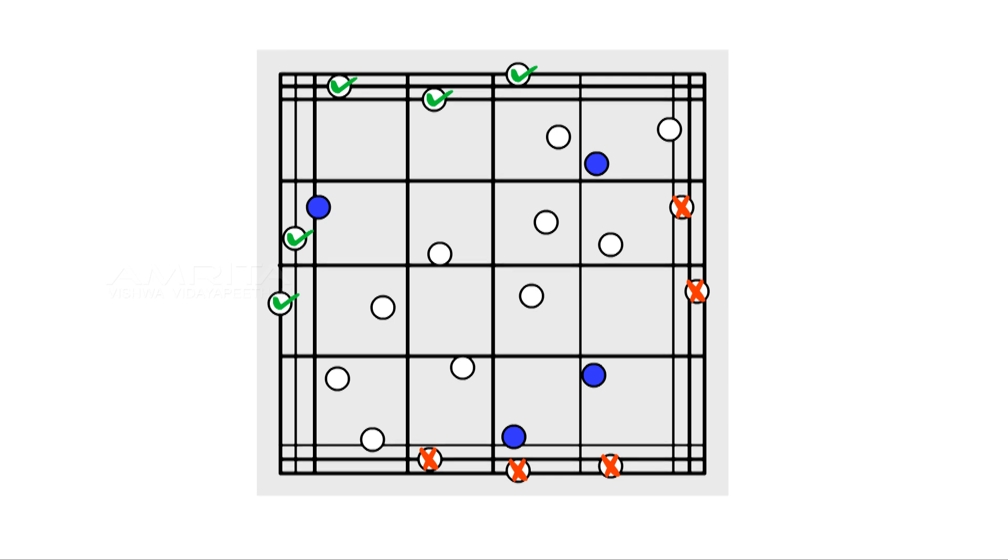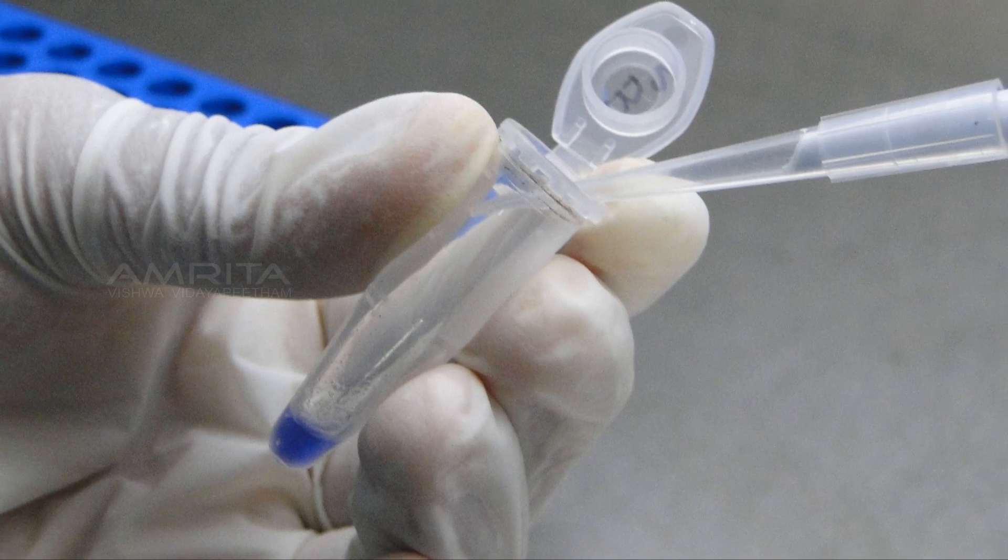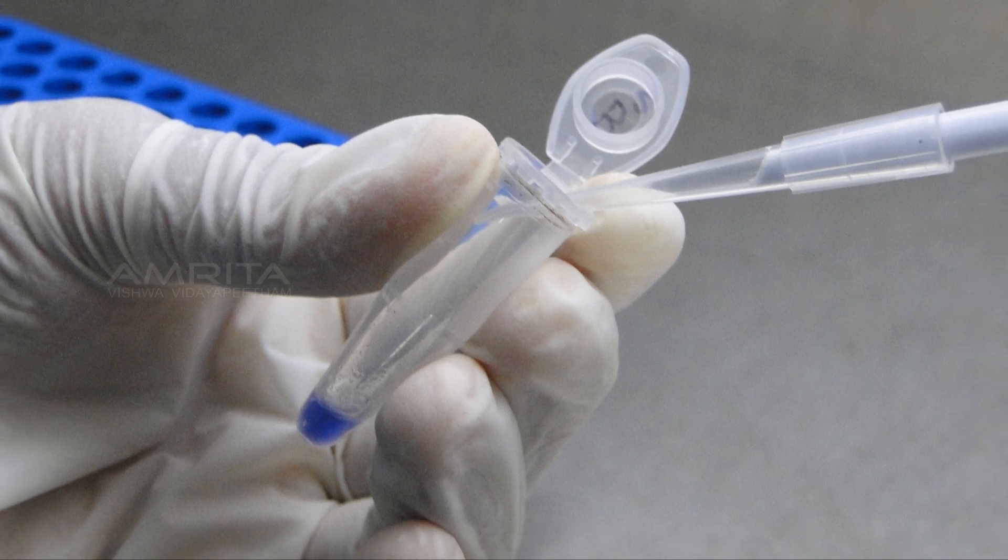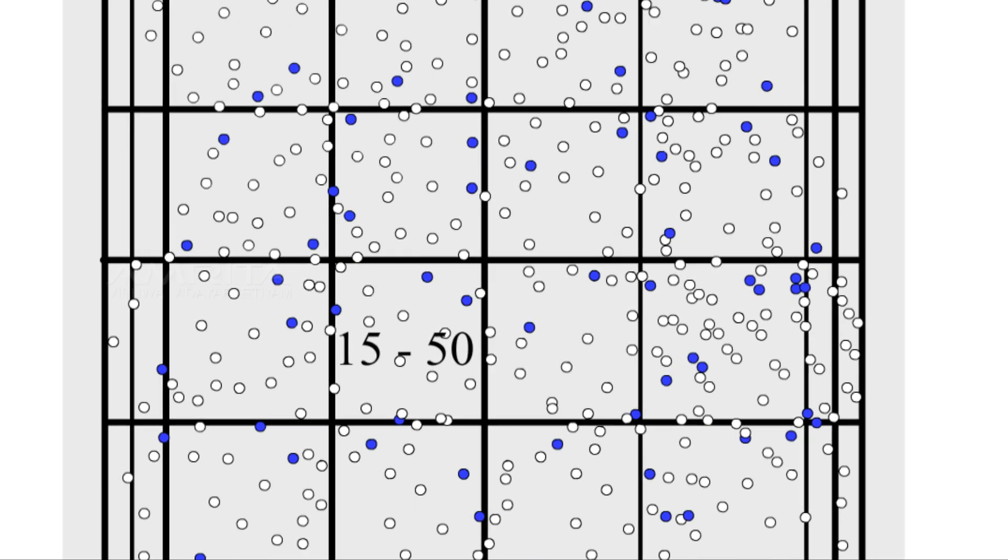If there are too many or too few cells to count, repeat the procedure either by concentrating or diluting the original suspension as appropriate. For an accurate determination, the total number of cells overlying 1 millimeter square should be between 15 and 50.